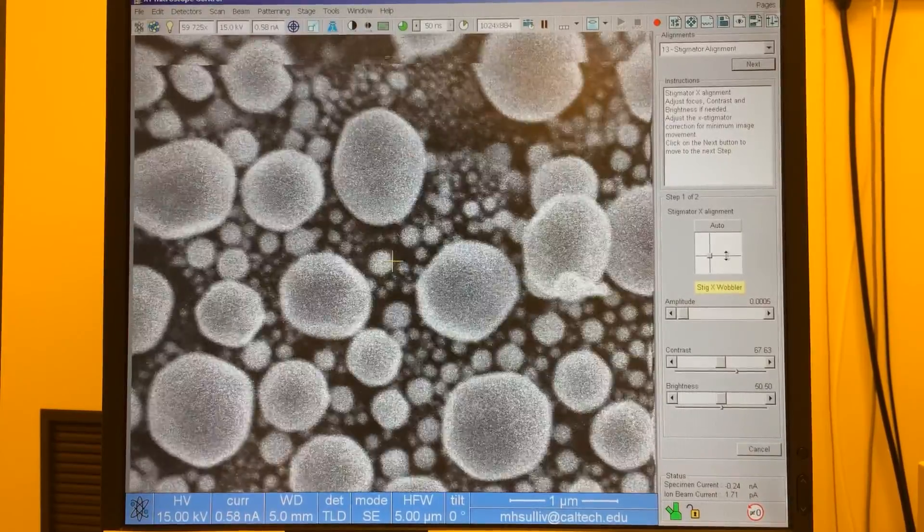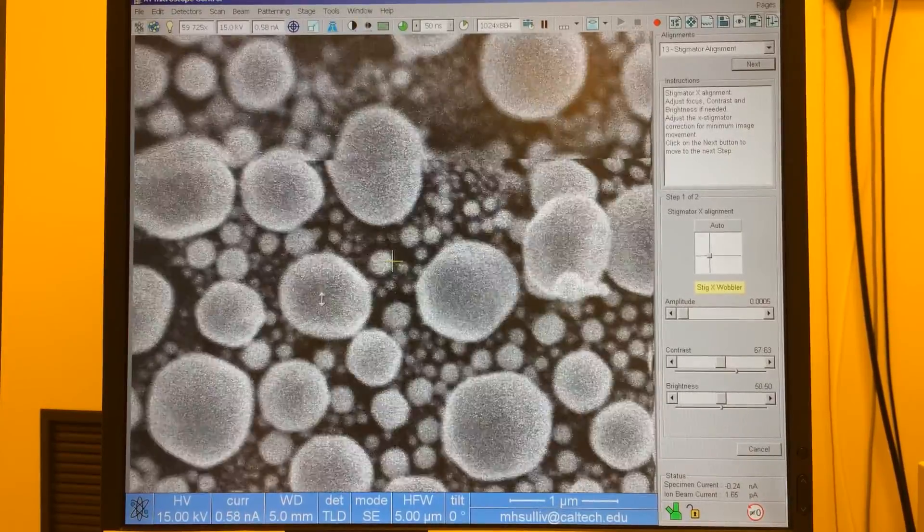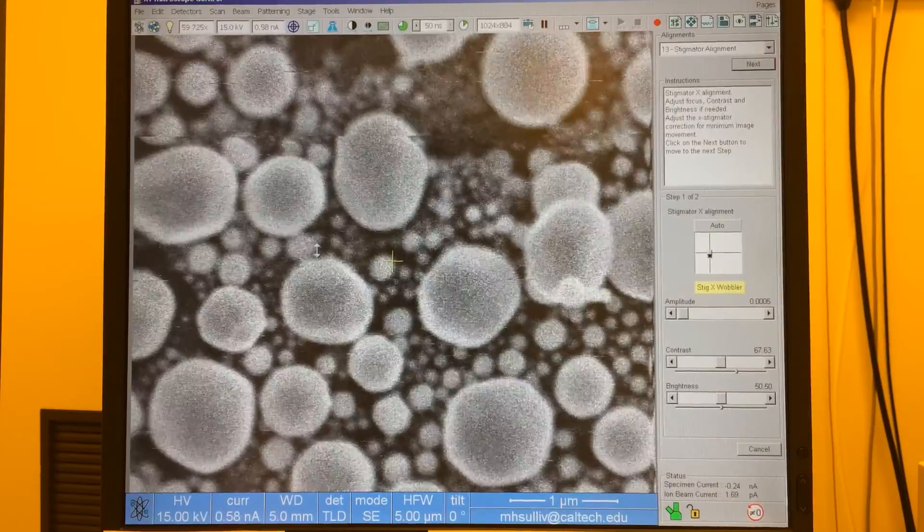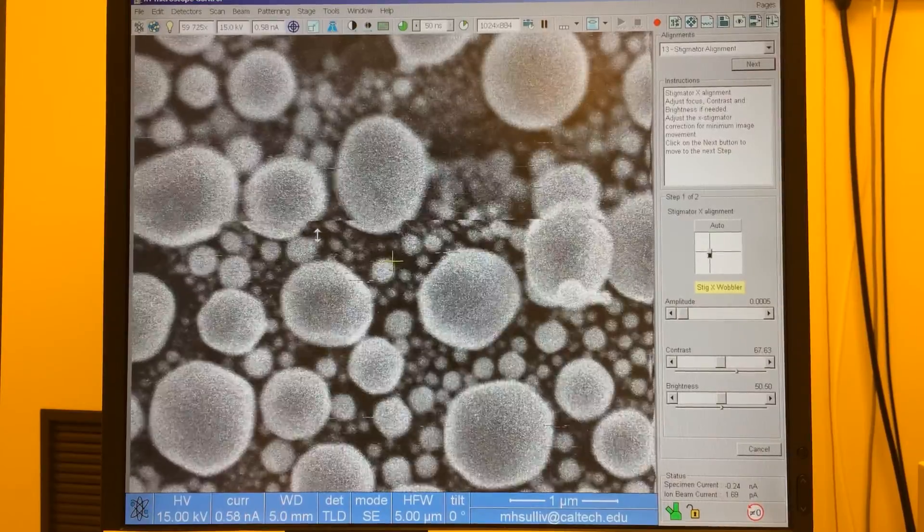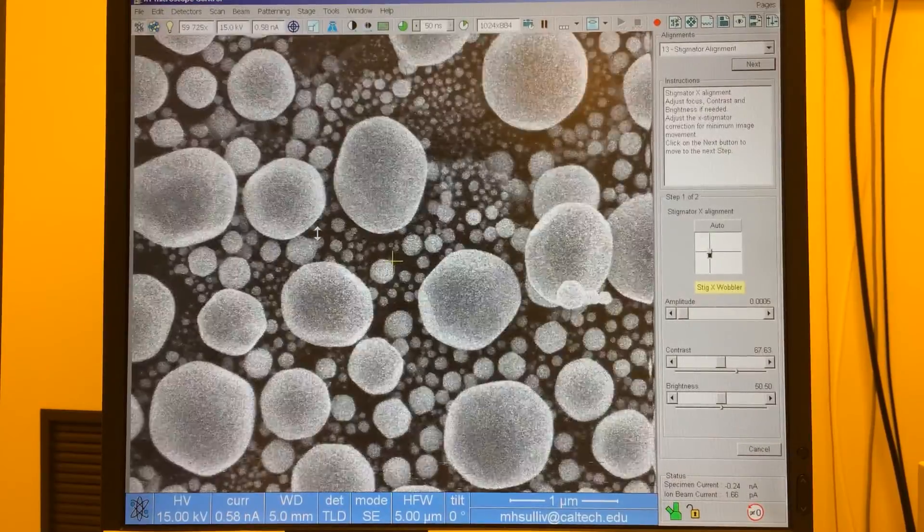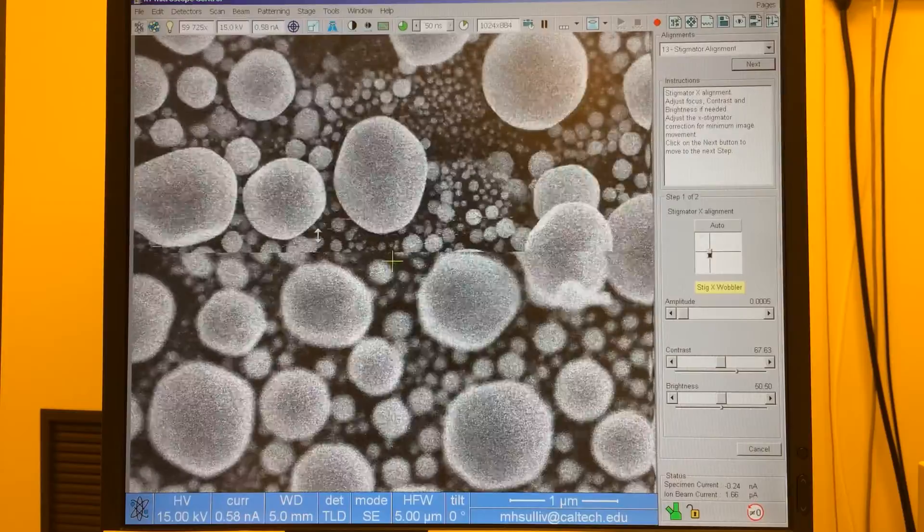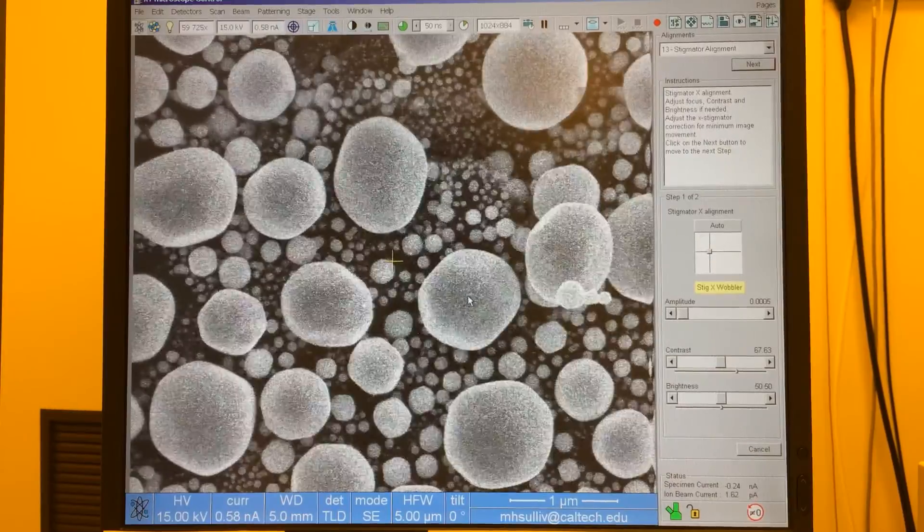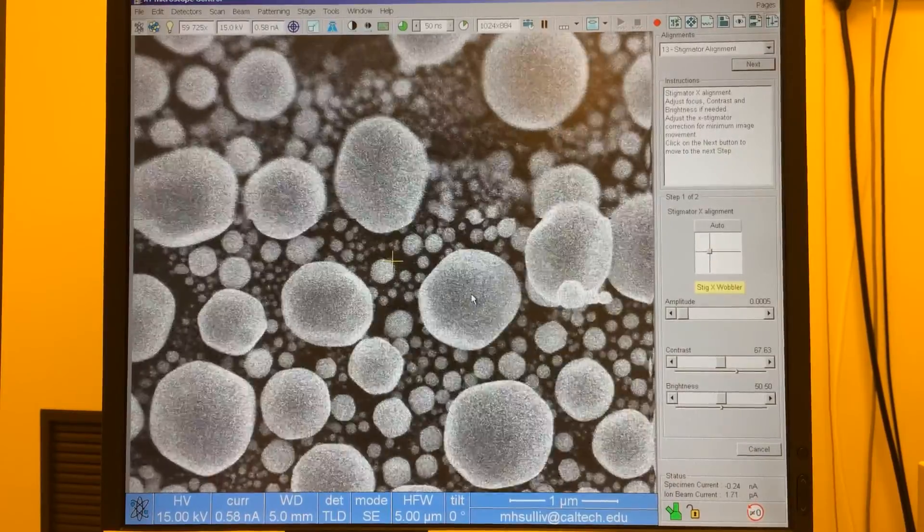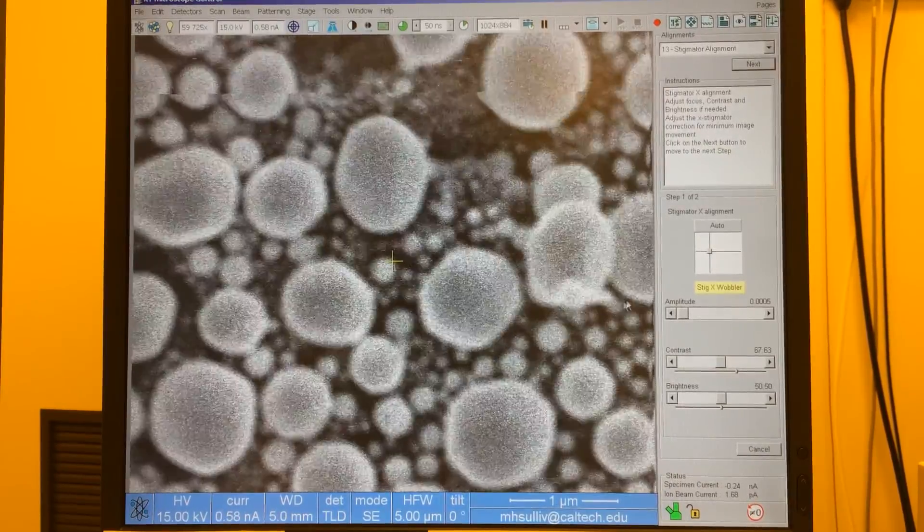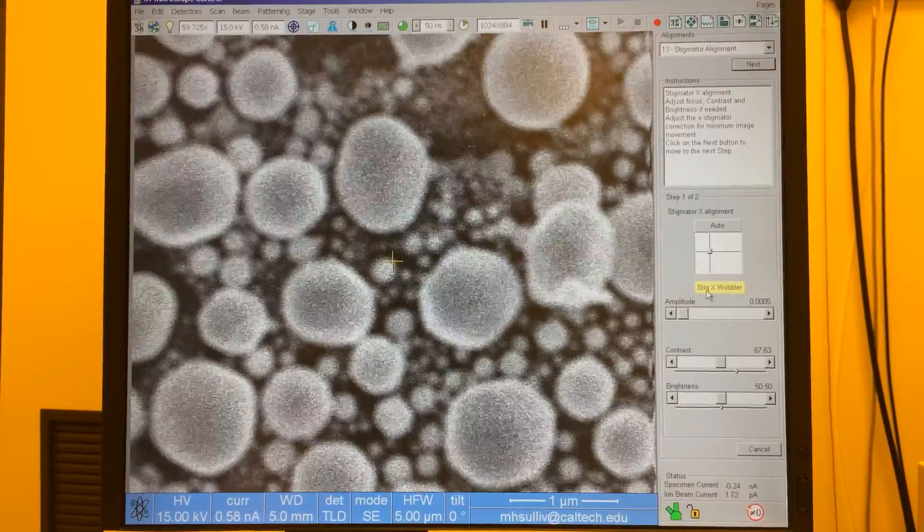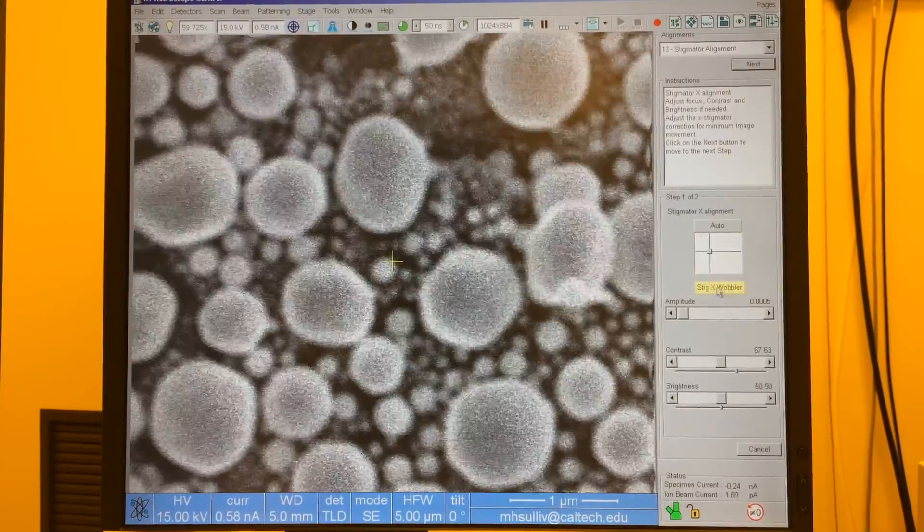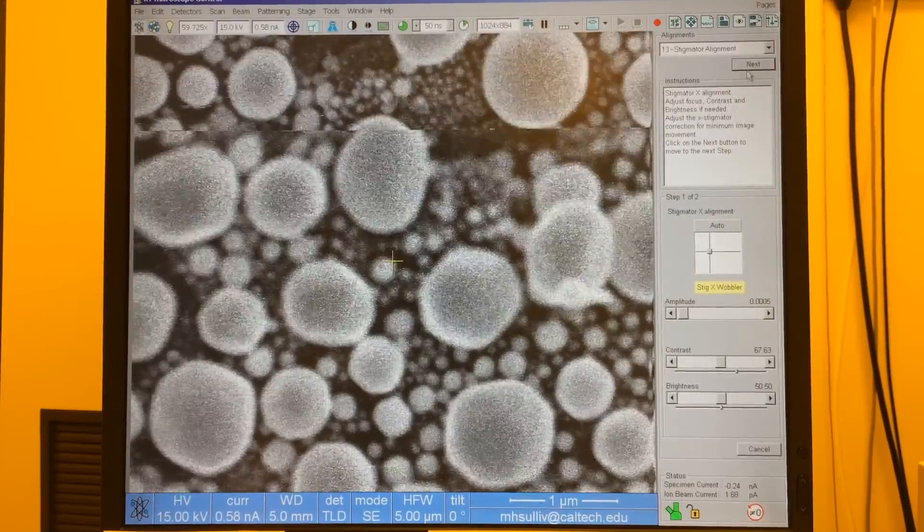So now I'll grab the horizontal bar and I'll move that up and down to minimize the y oscillation. And the idea is to get it to blink in place just like we would with the lens alignment. So we fixed now the x astigmatism wobbler.